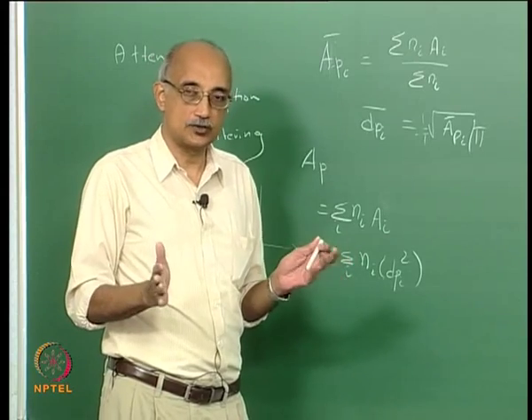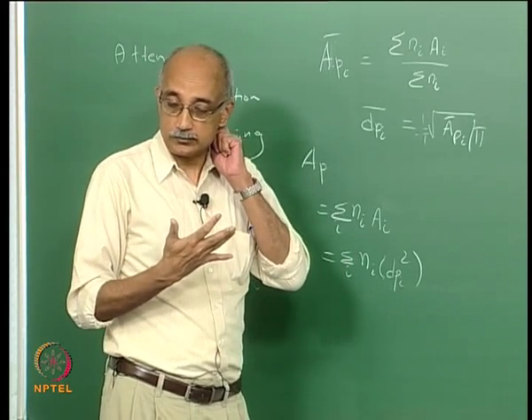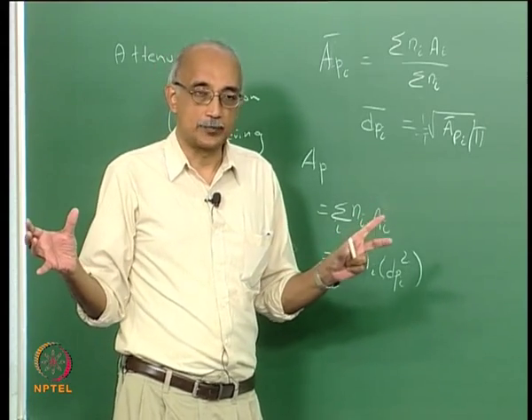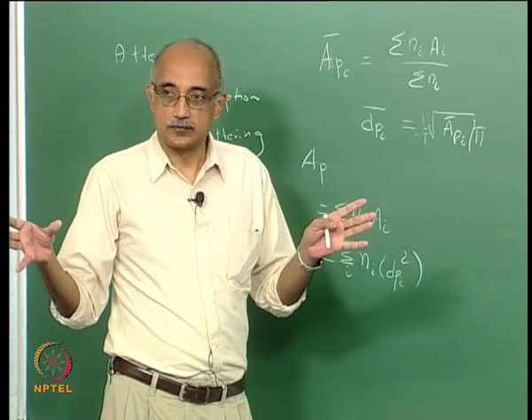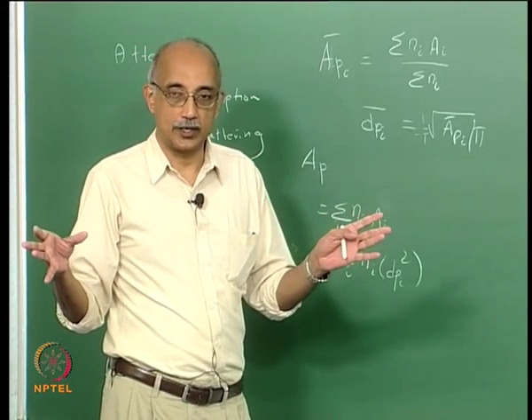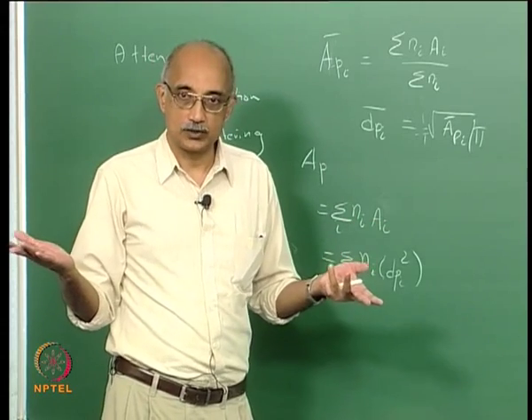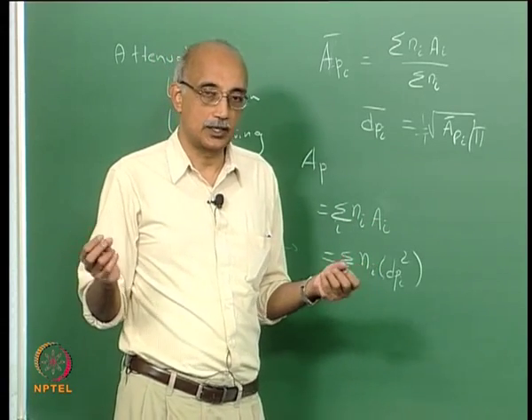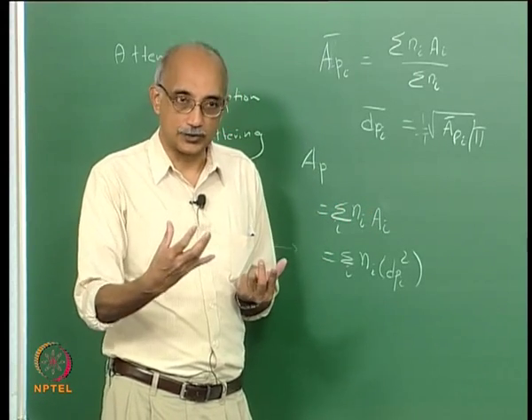If you know that one is fixed, you can estimate the other through a relative measurement. But when you have two random samples being supplied to you, let us say by two different cities, and you are asked to assess which one has higher concentration and which one has larger particles, you really cannot tell. All you can tell is this number, which is really a sum of the two.